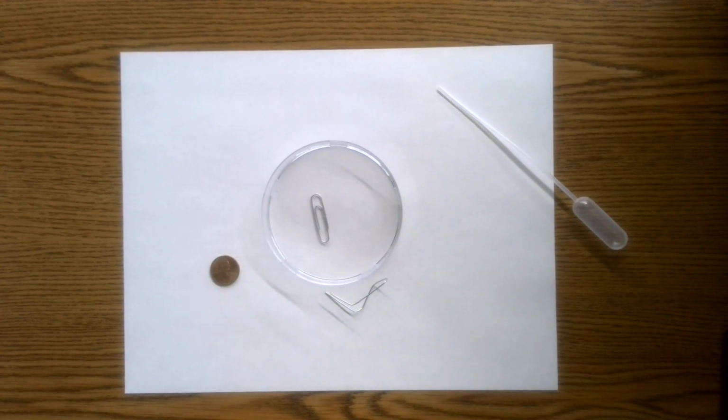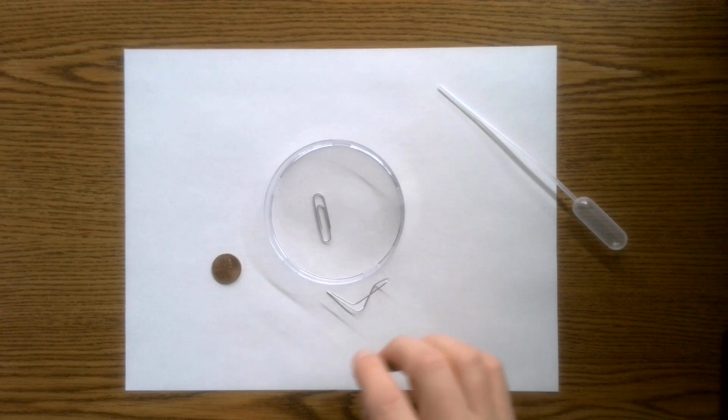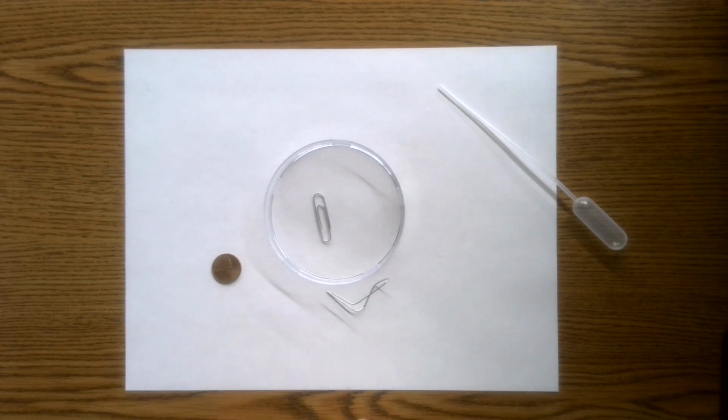In your notebook, in your workbook, okay, you're going to write and draw out these images that you've done in your lab and use the words adhesion, cohesion, capillary action, surface tension to describe the phenomenon of water. So you're just going to experience it yourself and draw it in your book, and make sure to use those terms.